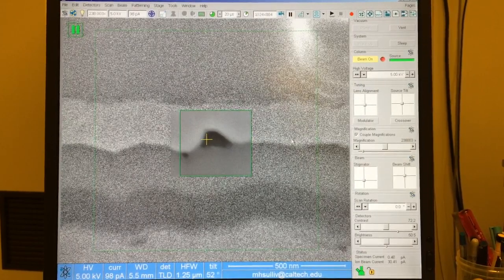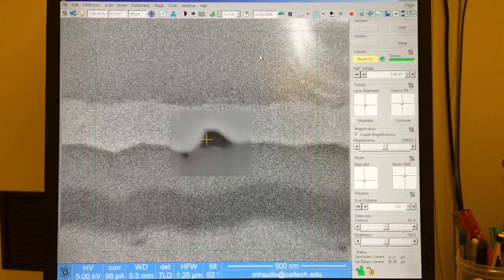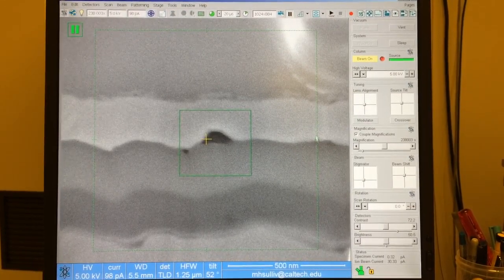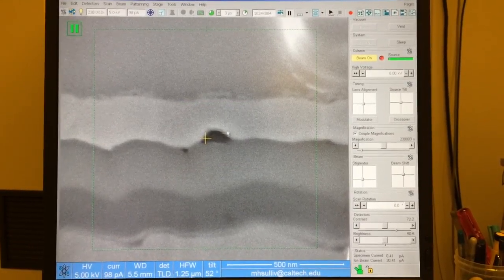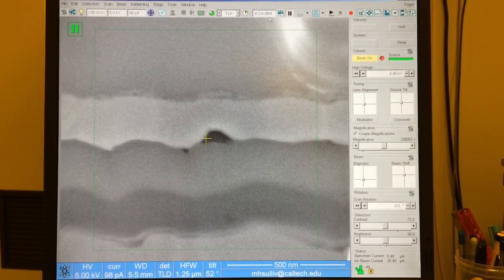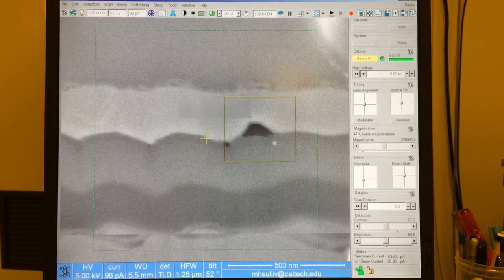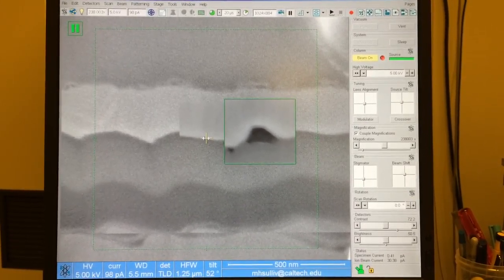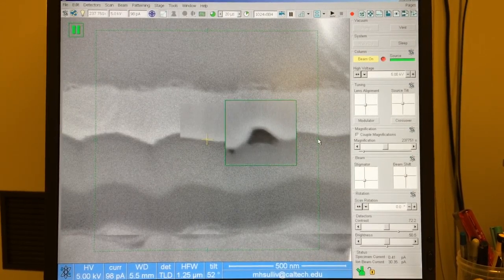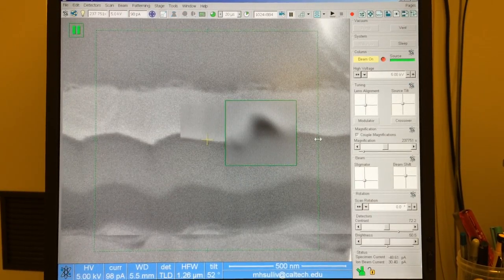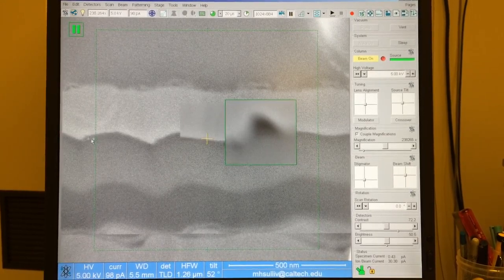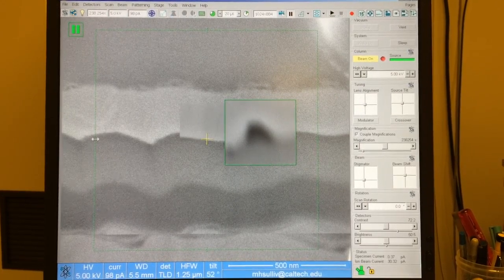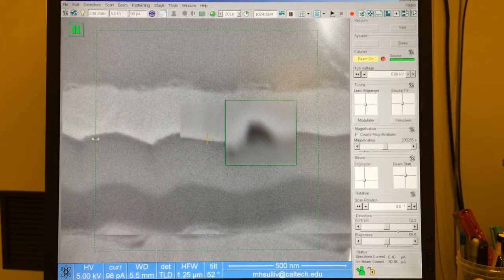The principle now is using the center cross and the alignment rectangle edges. I'll grab a slightly longer dwell time image for a background that'll allow us to see the rectangle a little bit better. I'm also going to beam shift this feature away from the center cross. So if I put the reduced window around it now, we can get to work. The technique works by starting with focus at the center cross, then moving all the way over to the alignment rectangle edge and pressing F6 to grab a frame. We compare that to focus equidistant on the left side of the alignment rectangle — F6 to grab that frame — and evaluate whether it was better or worse. It's hard to compare all the way to the left versus all the way to the right at this high magnification.